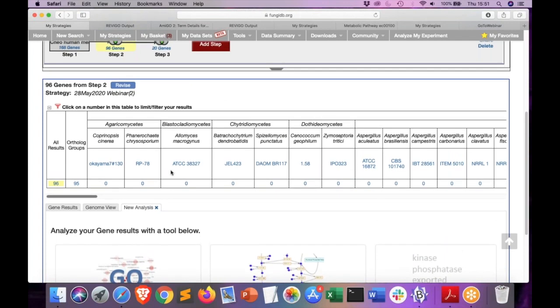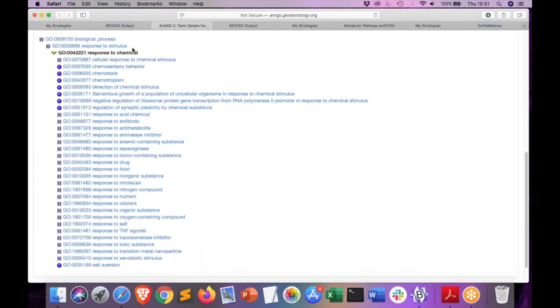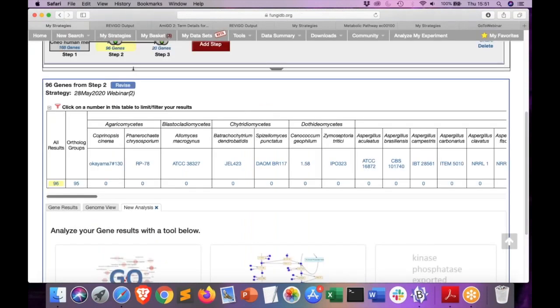A higher-level annotation, such as the ones I showed you before, like response to stimulus, may be annotated, or the genome may have been run through UniProt and we may have some information, but you won't know until you see what information is associated with these genes. You could run GO Slim, or run both and see how the results differ. For those genes that have no GO annotations, a good procedure would be to look at all supporting data, including orthology and synteny profiles from other organisms.